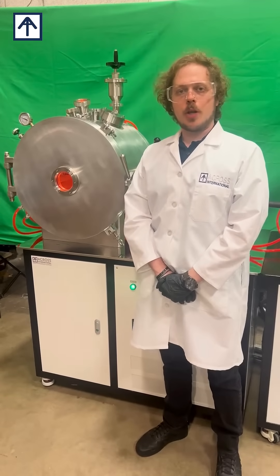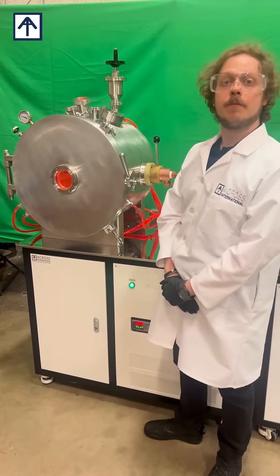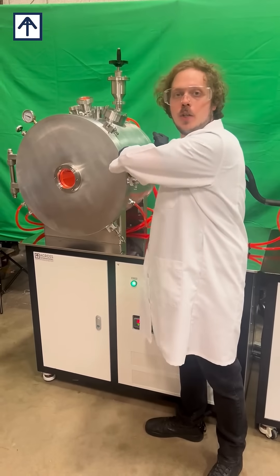This is Maxwell, Director of Business Development at Across International, here to show you the VIF 2000 series 3 kilogram vacuum induction furnace.